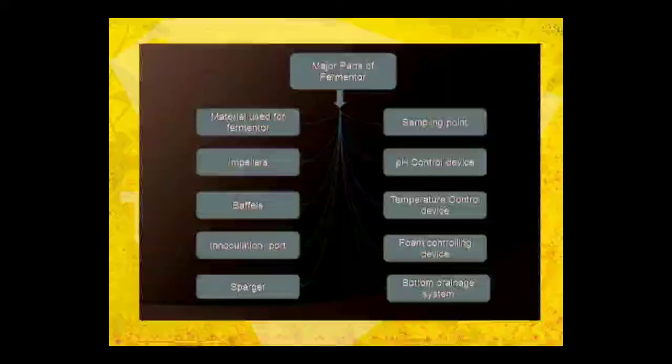As you have already seen in the diagram, the different parts and their location in a fermenter. Here I am summarizing the different parts of the fermenter.